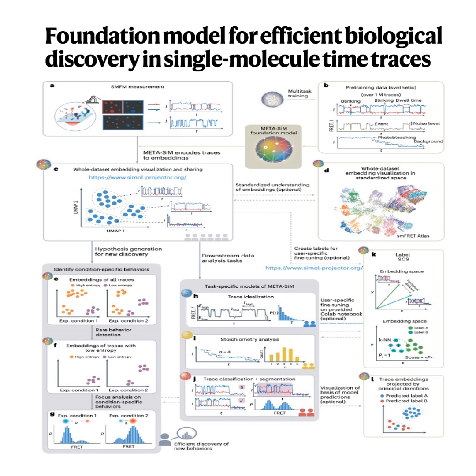LSE pointed right to it. That really shows the power. Okay, this brings us to what sounds like the ultimate stress test for META-SiM, analyzing pre-mRNA splicing in yeast. Yeah, it's a notoriously complex system, a real beast. Lots of components, dynamic rearrangements, multiple steps. Perfect place for important intermediates to hide.